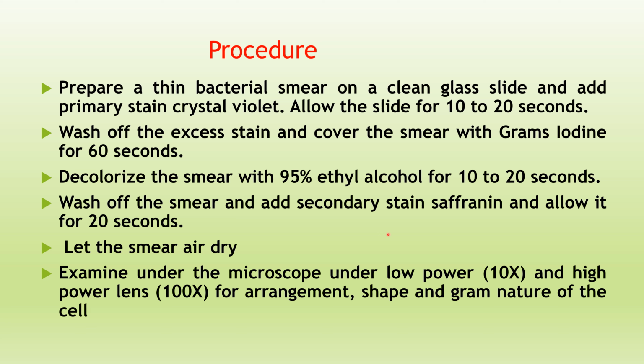Microscopic observation will help you to observe whether your clean glass slide has the smear. That smear will have either Gram positive bacteria or Gram negative bacteria. If you see Gram positive bacteria, they will appear in purple color and Gram negative bacteria will be observed in pink color. So like that you are able to distinguish.